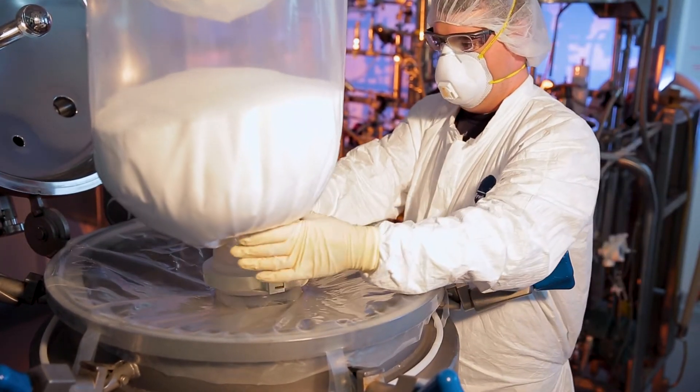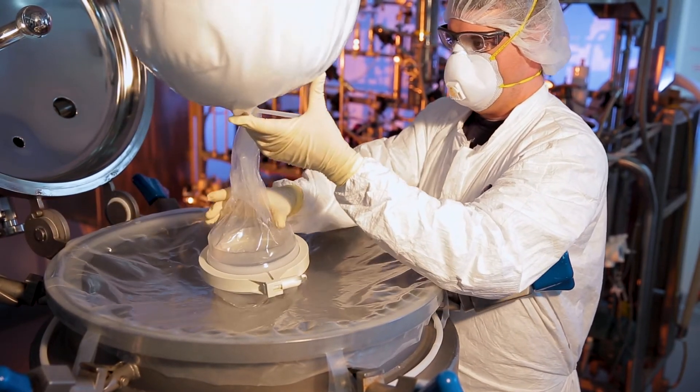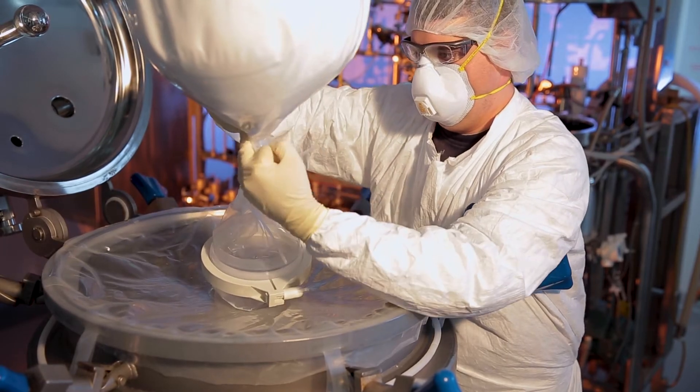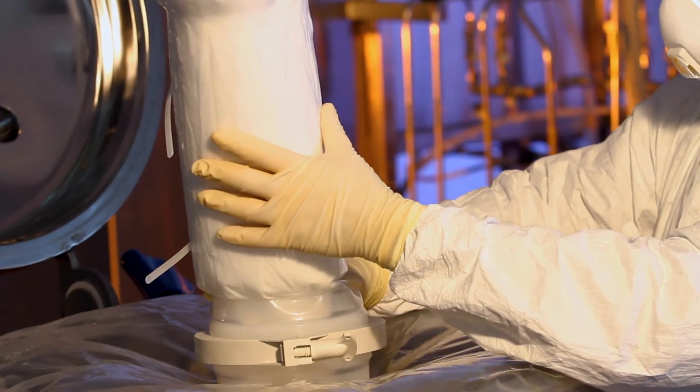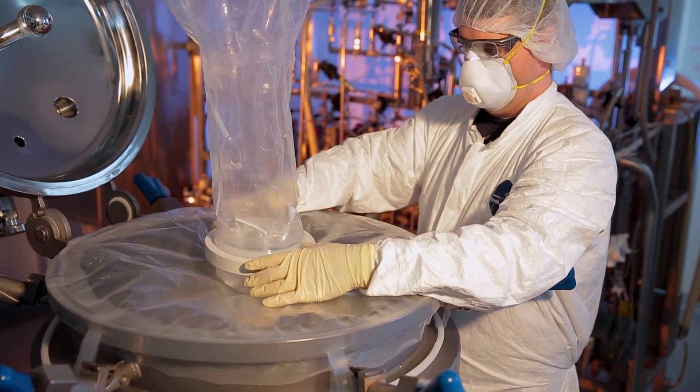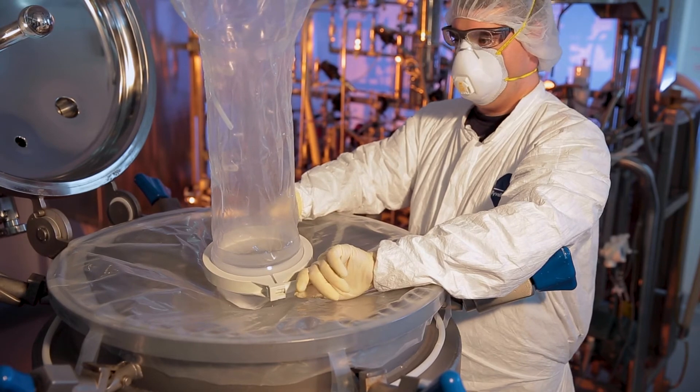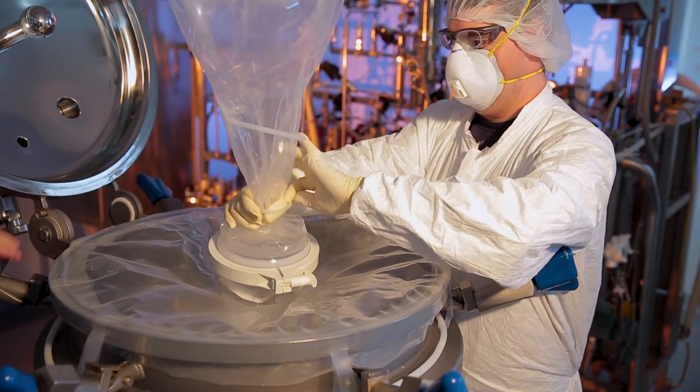While media and buffer ingredients are generally benign and stable, handling any powder can disperse fine particles into the air, and long-term exposure can cause harm. ILC Dover's EZ-Biopac system substantially lessens the amount of powder dispersed, so the risk of cross-contamination is lower, changeover time is reduced, and cleanup time is minimized, which can work together to increase both productivity and profitability.